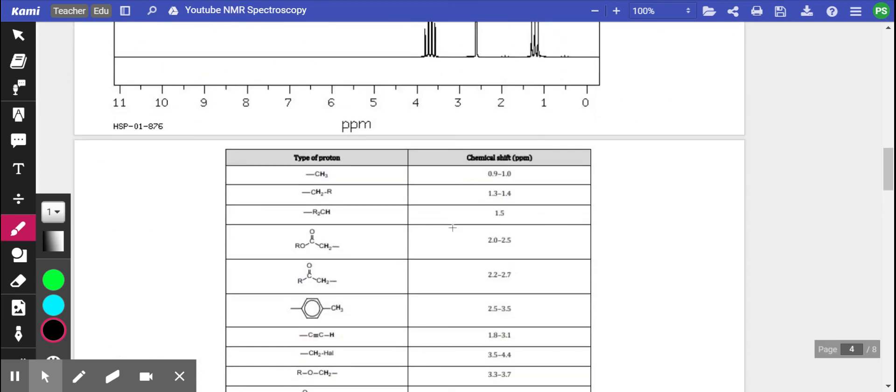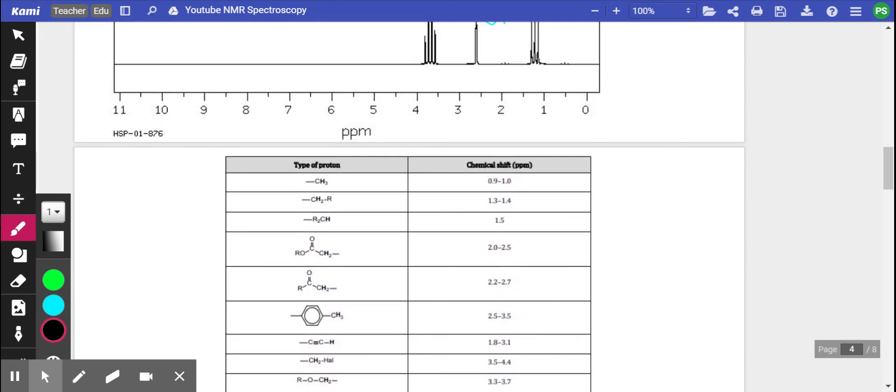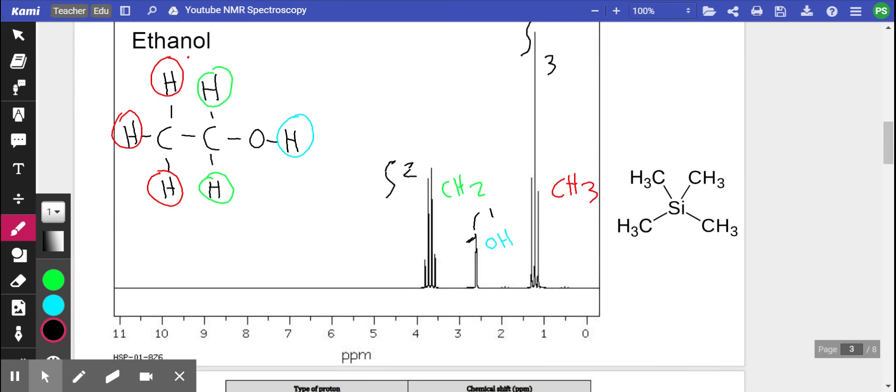And a CH2 group next to an oxygen is this one here, and it's 3.3 to 3.7. And in fact, as we can see in ethanol, it is at 3.7.